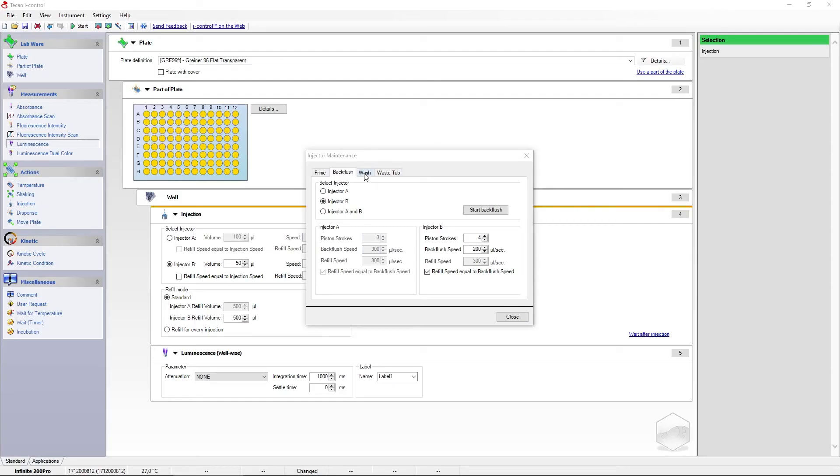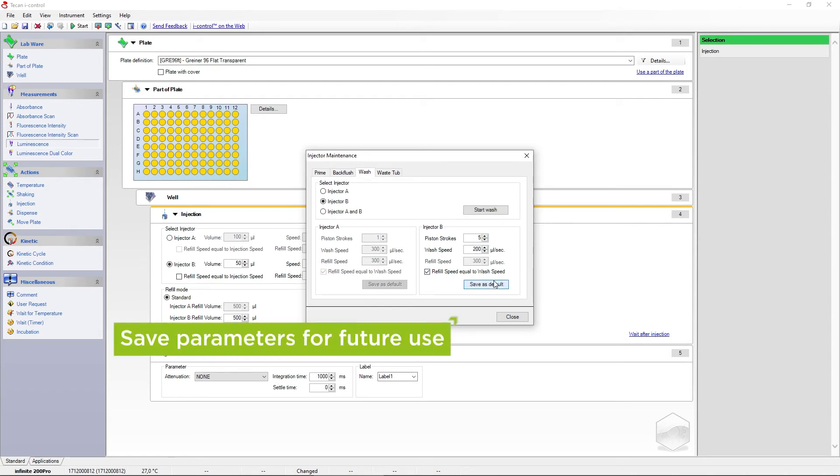Adjust the washing parameters under Settings, then Injector. Instead of volume, you can adjust strokes, with each stroke corresponding to one filling of the syringe. You can save your rinsing parameters for future use.